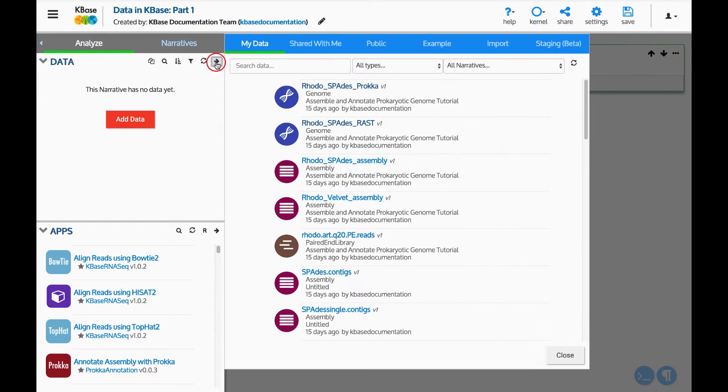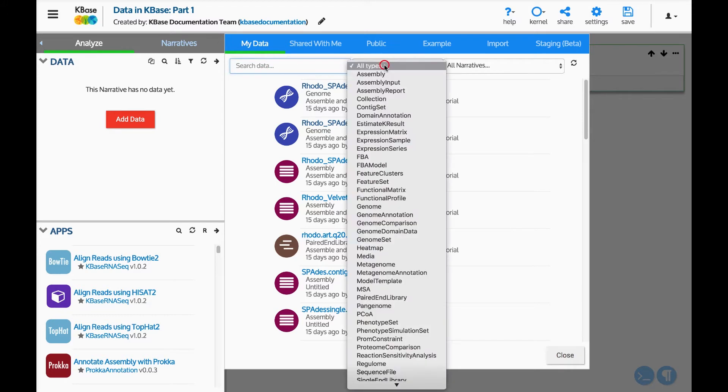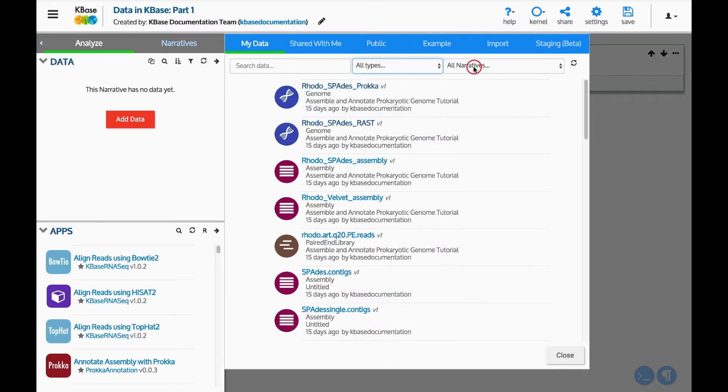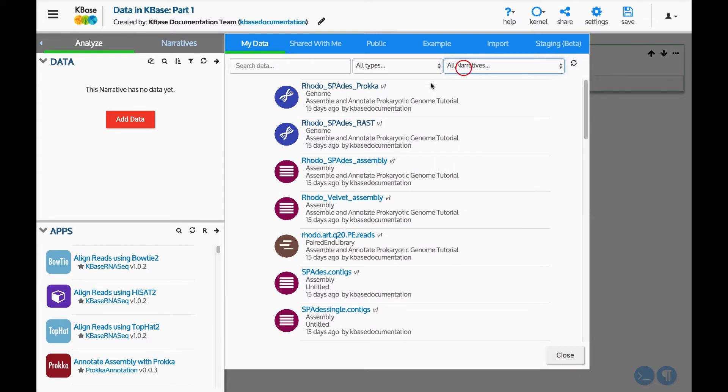On the top of the slide-out, there are many tabs with options for loading data into a narrative. The left-most tab is My Data. This will show you all the data in KBase that is in one of your narratives. You can search your data and filter it by type or the narrative it is in. I will add a genome from my data that exists in another narrative.